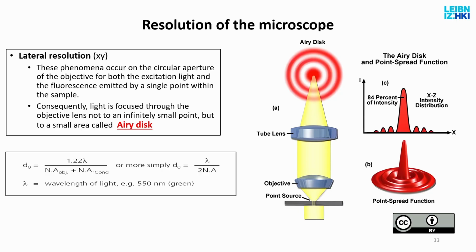What happened here was that this small object, this small molecule, for example, emitted light, which went through diffraction, and as a result formed an interference pattern. So there is a small spherical object here, and here there is a pattern which has nothing to do anymore with what I imaged.